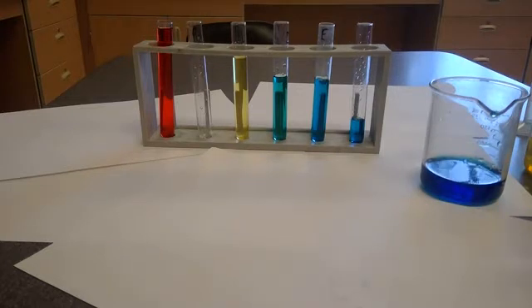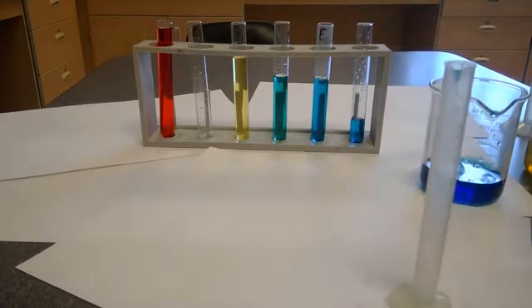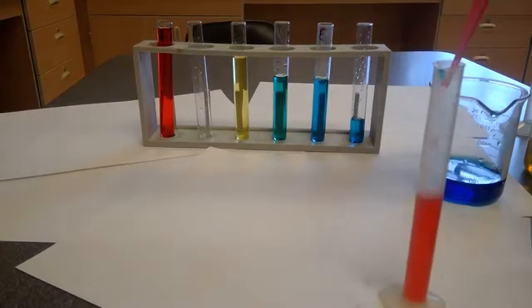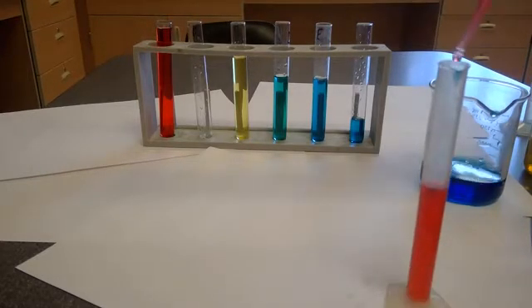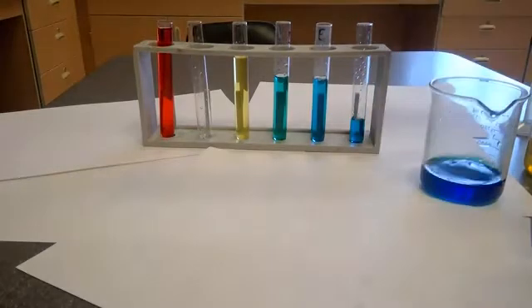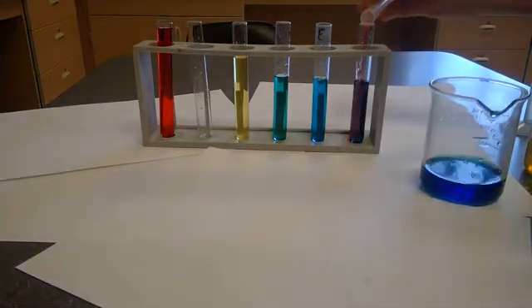Now it says then, from the beaker of red water, I'm going to take 7 milliliters and I'm going to also mix that into test tube F. So here we go. 7 milliliters. Almost there. Excellent. So now this is going to go into test tube F.